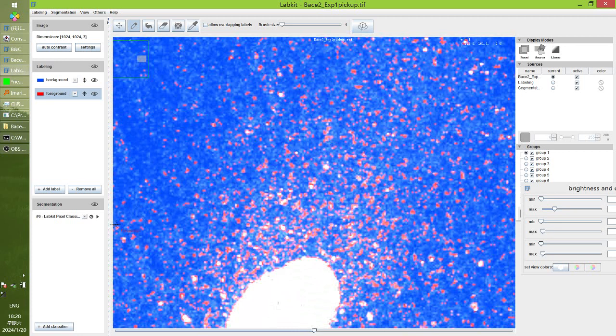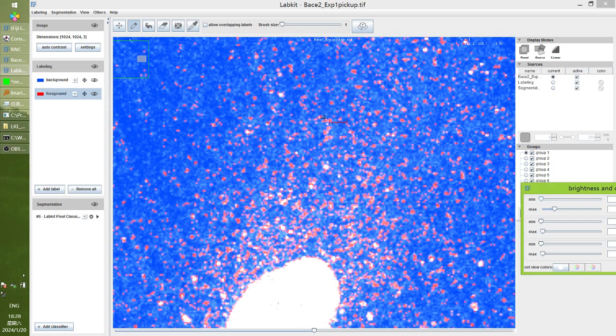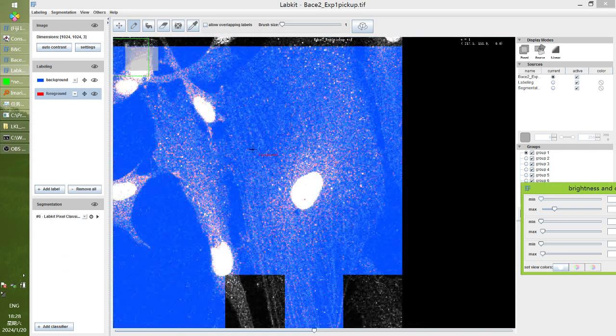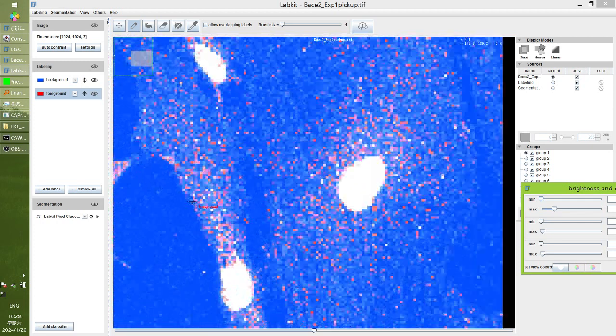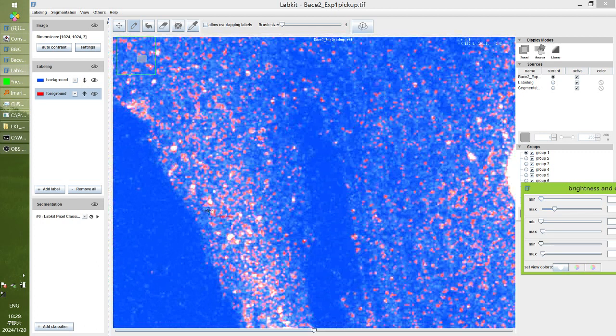Do not make very much amendment before you train again, because it is usually useless to draw too much, and it will cause the classifier file to be too large and slow the speed of the image processing. So always try many times, but each time only make several tiny modifications. Do not go the other way around.